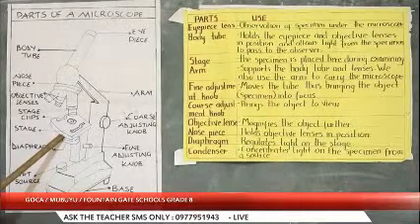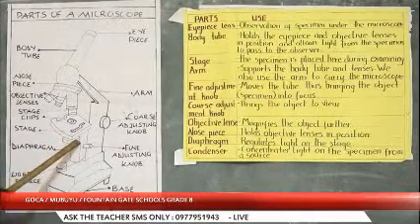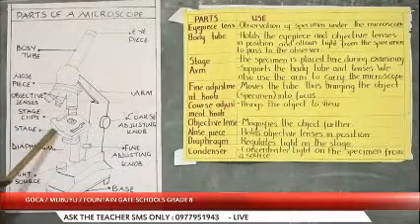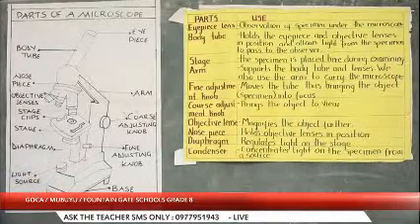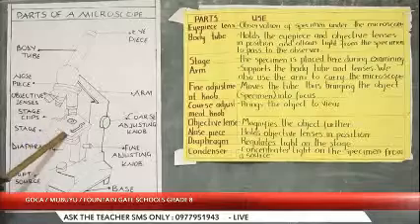Okay, so the diaphragm, its function is to regulate light on the stage. And where is the stage, class? Okay, so the stage is just here.